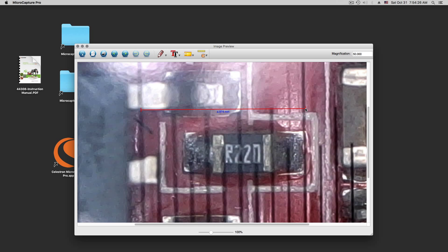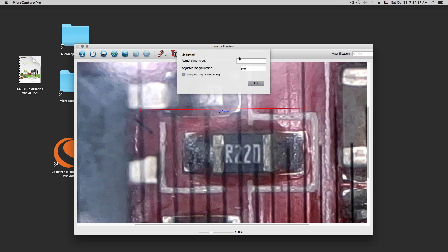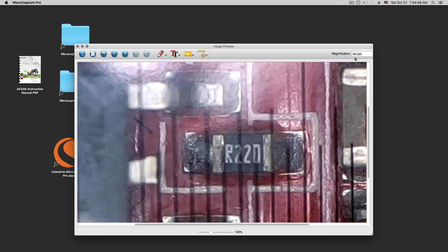And we know this is 5 millimeters. So, it's a little less, 4.9. We know 5 millimeters. You type in 5 and say OK.